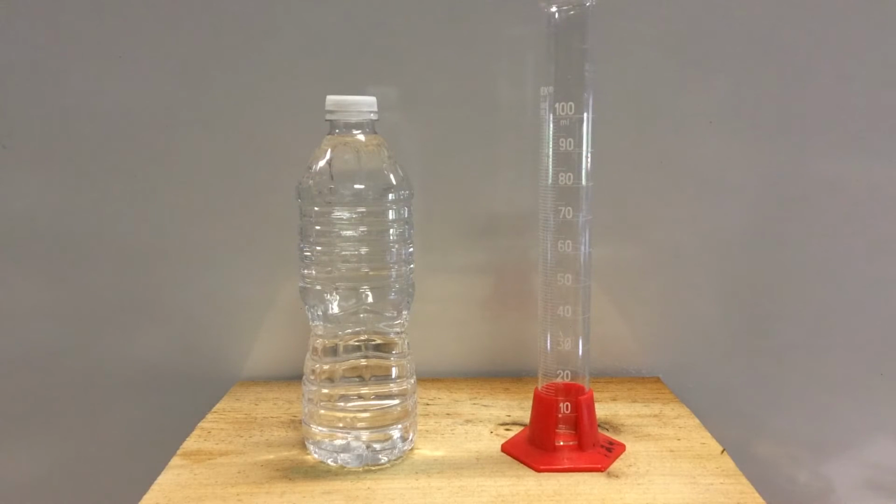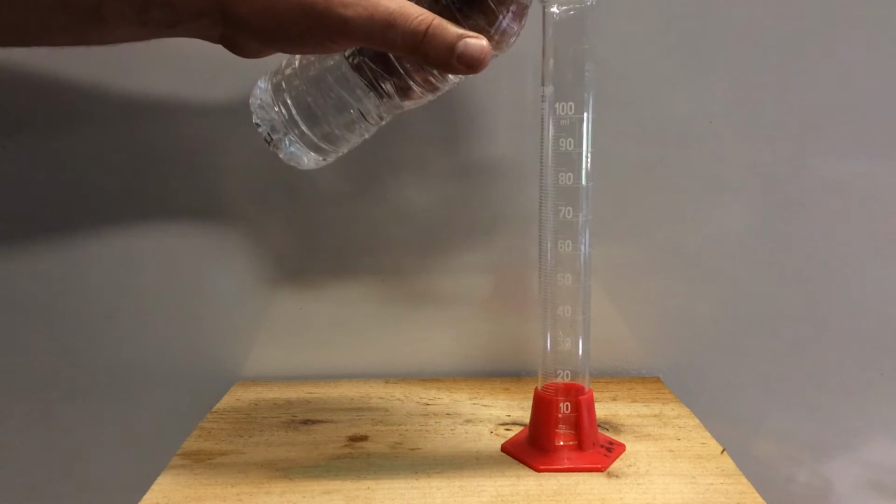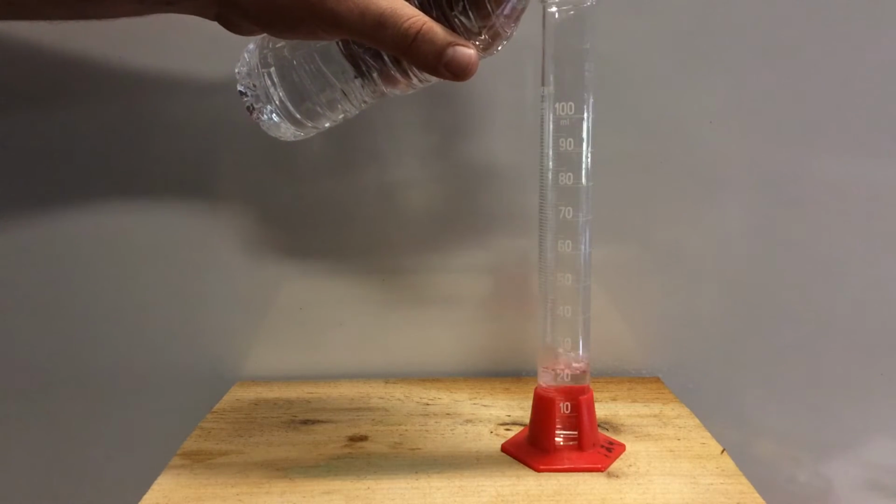So we're going to start with water. It's our first data table, and we're going to use a graduated cylinder this time to measure the volume. We can't measure the dimensions of a liquid because a liquid doesn't have a regular geometric pattern. It takes the shape of its container, something very important for the Regents chemistry curriculum. So all I'm going to do is take some spring water, and I'm going to pour it, and I'm going to fill it to the 100 milliliters mark.